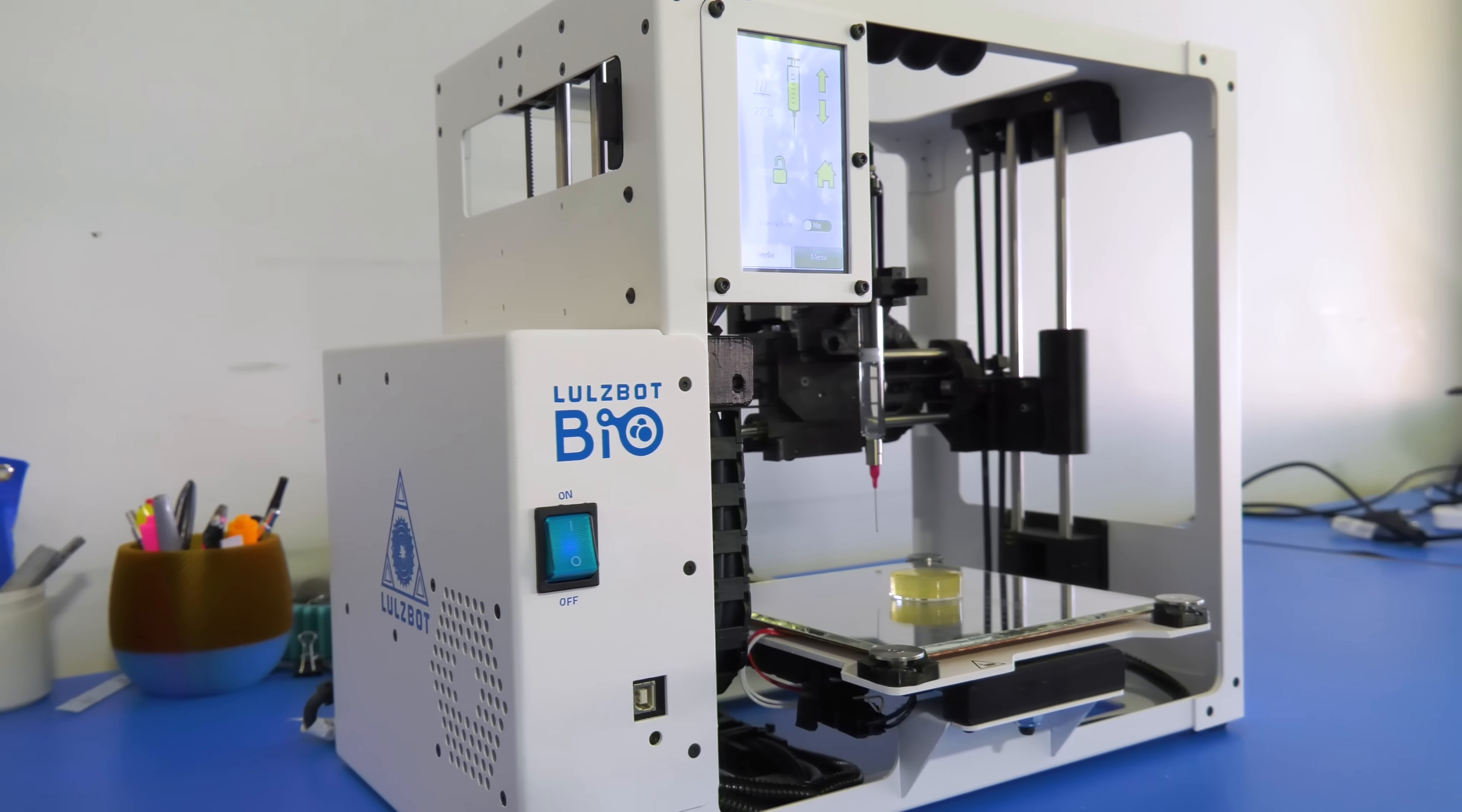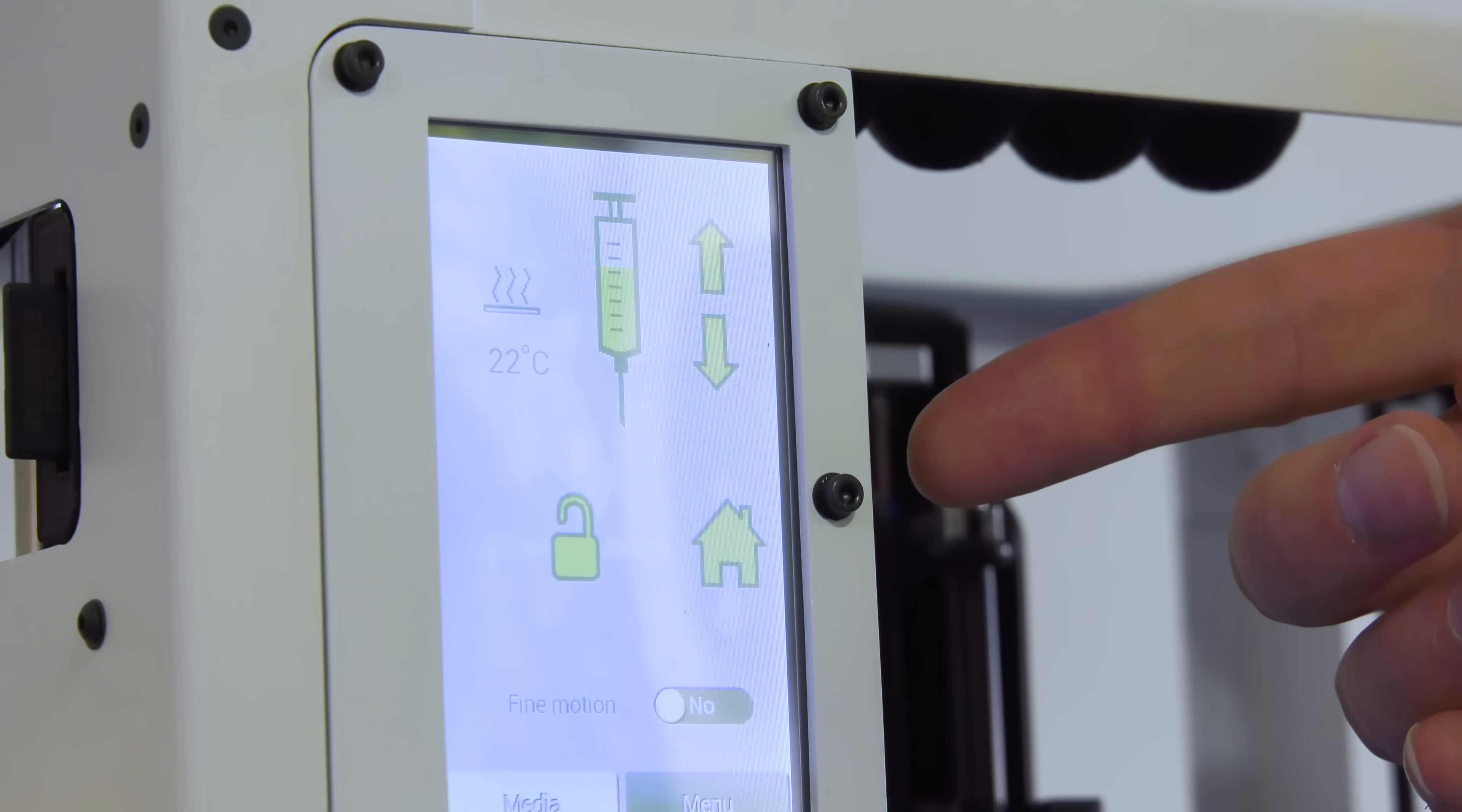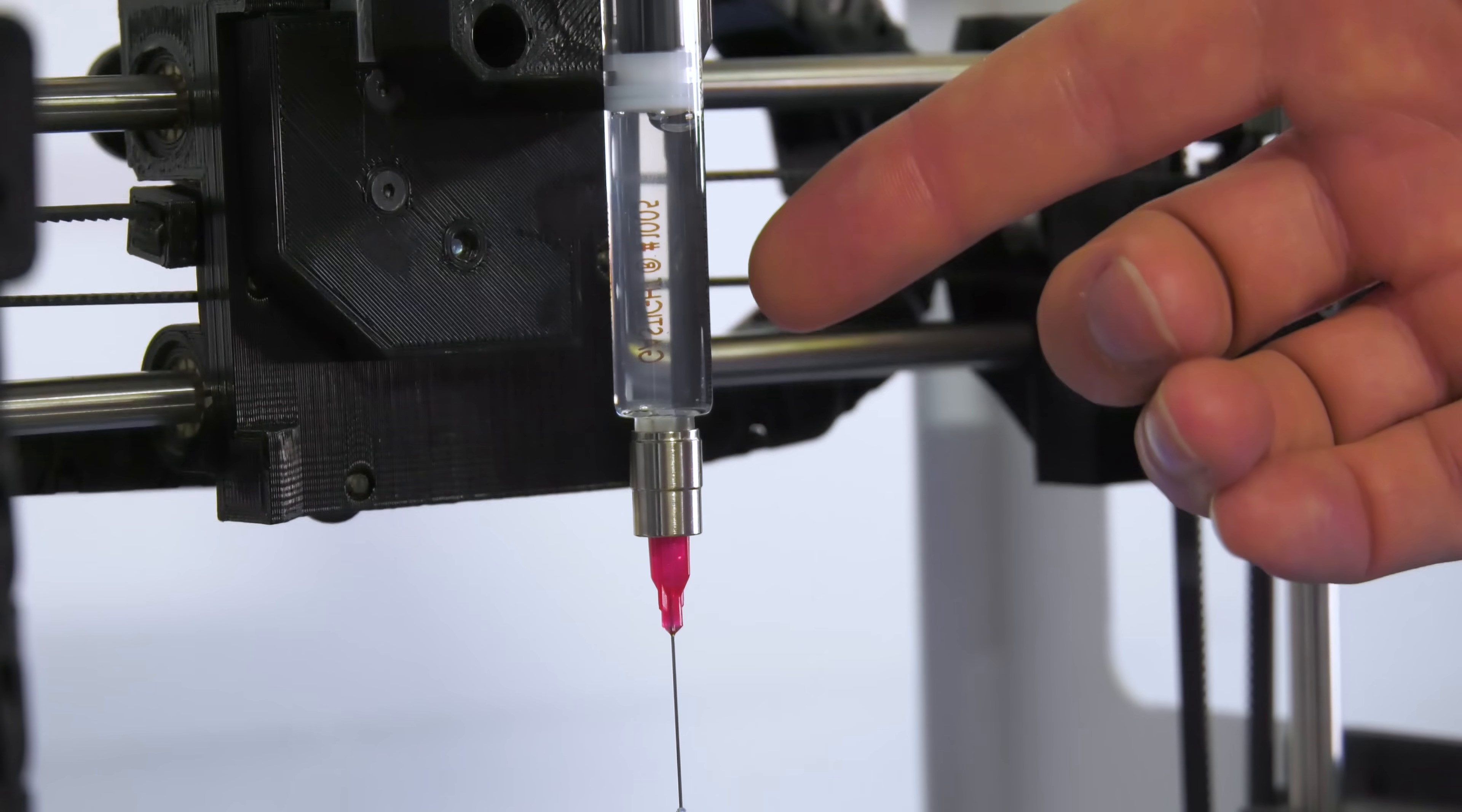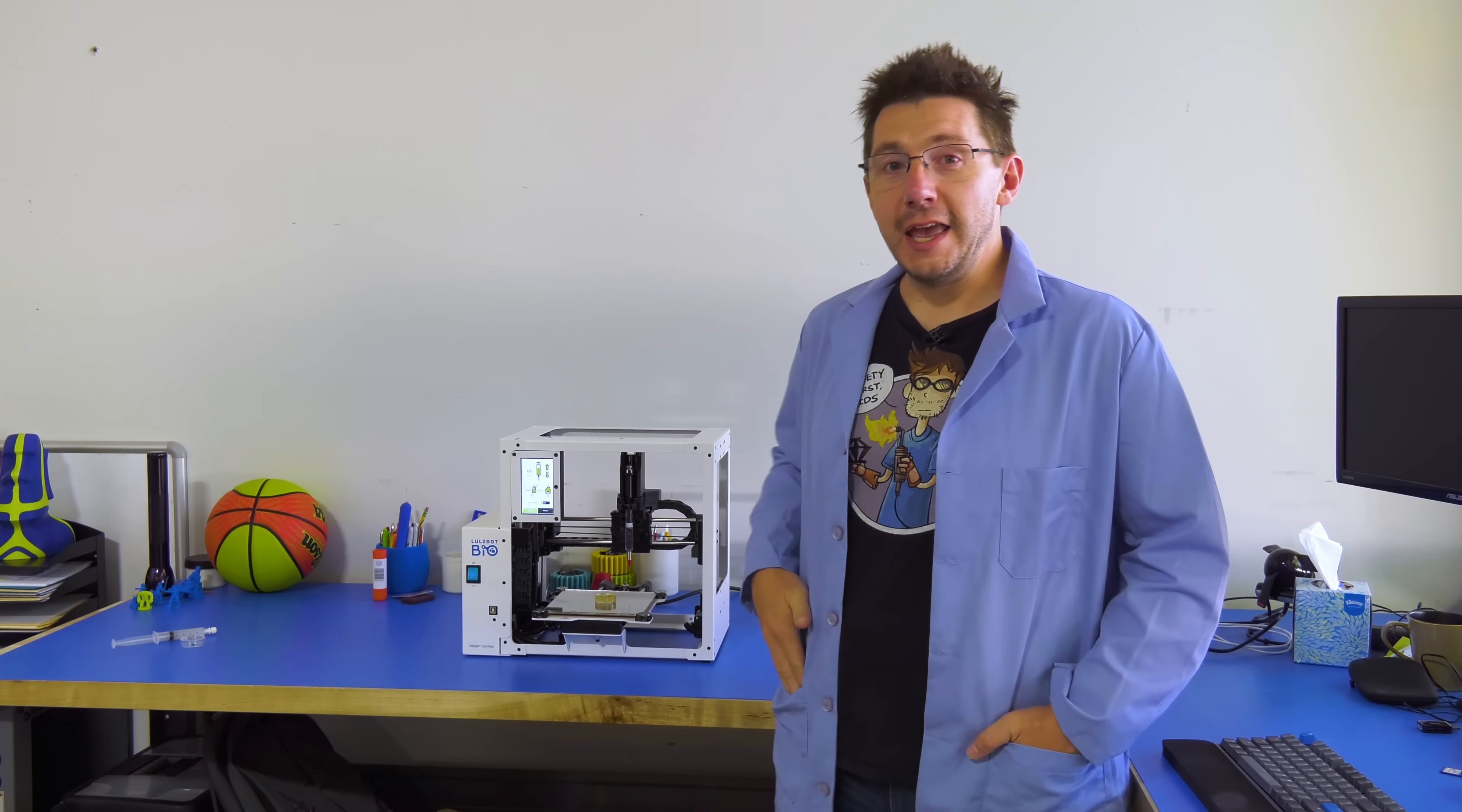This is the LulzBot Bio. It may look familiar to many owners because, well, that frame is a familiar frame, but unlike your Mini, this can print collagen and stem cells and all sorts of biomaterial. It's changed a bit because you have, well, first, a blue power button. It's a nice blue. It has this touch screen up front, which then moves this printhead around. This is not extruding plastic. This is a syringe extruding biomaterial. And rather than printing on a print bed itself, the bed is there, minus the PEI, and instead, there is a support gel that holds the material that you're printing. And what's fantastic, it's LulzBot. So this entire platform is open source.